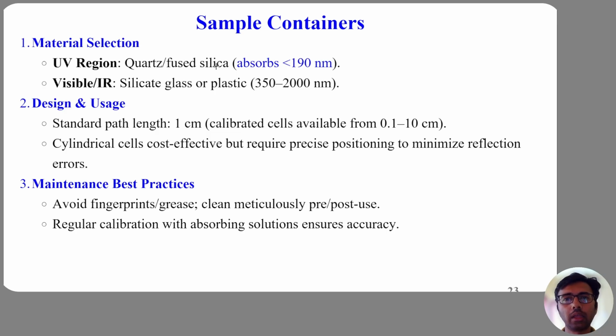Let us now discuss the geometry. The globally accepted standard path length is exactly 1 centimeter. This value appears directly in the Beer-Lambert law. Specialized cuvettes do exist, 0.1 centimeter for concentrated samples and up to 10 centimeters for extremely dilute solutions, but 1 centimeter remains the universal default.